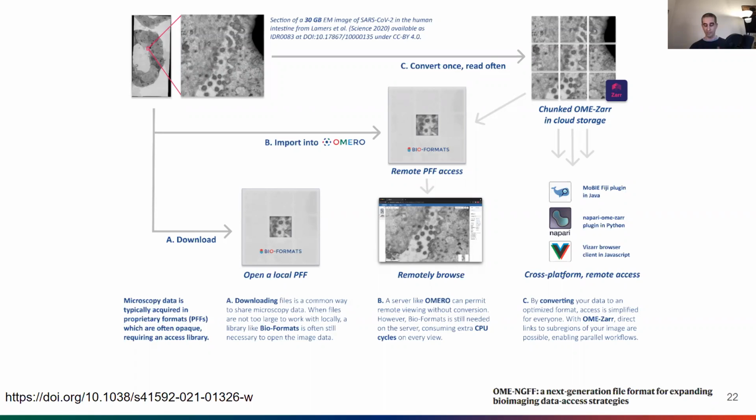So none of the file formats that we're currently using were built for living in the cloud. And we can talk about why that is later. So what we've tried to do here is develop a format that's open and transparent, really, to the end user. So no more using something to try to figure out what's in the file, break it open, store it in the cloud, and have as many different applications access that as possible.